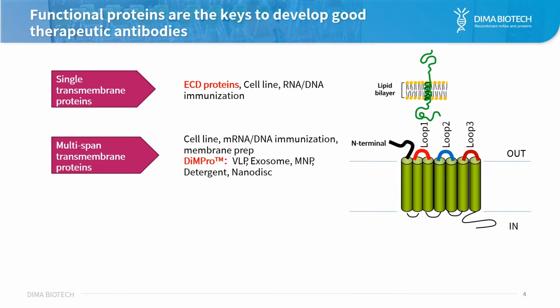The preparation of this multi-pass transmembrane protein is challenging. The ECD part of this protein is relatively short and sometimes form a short loop, so it is very hard to mimic the native status if you just express the ECD part.